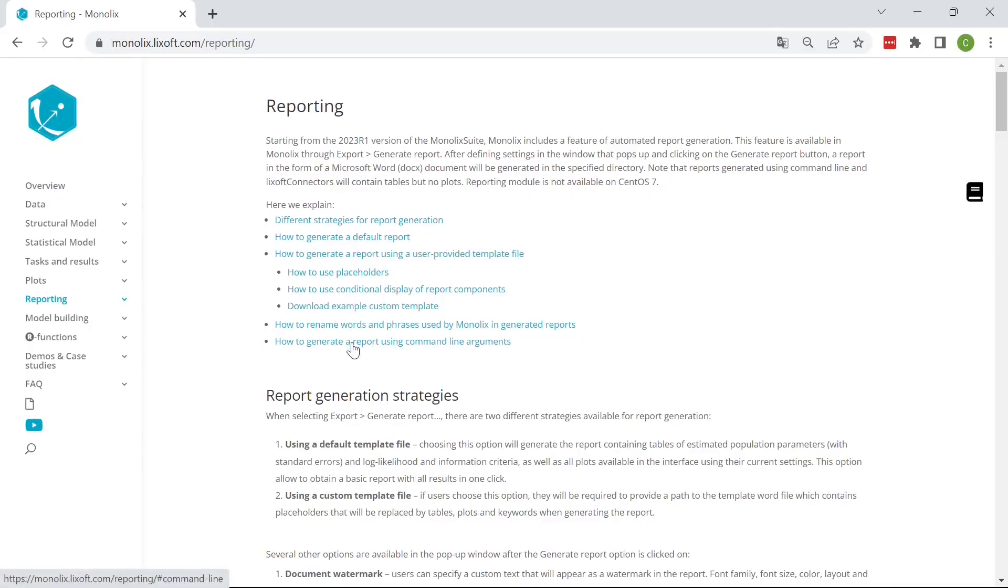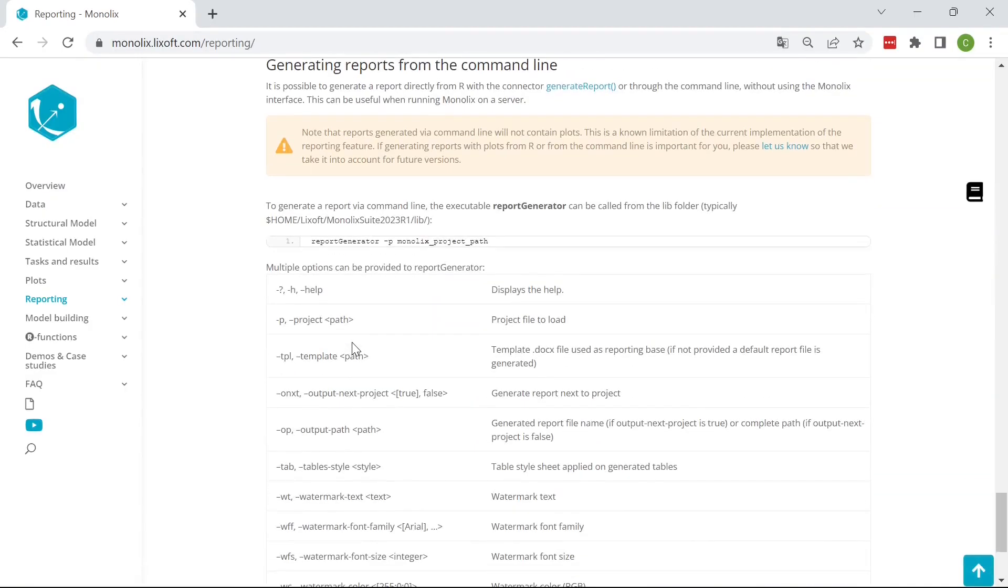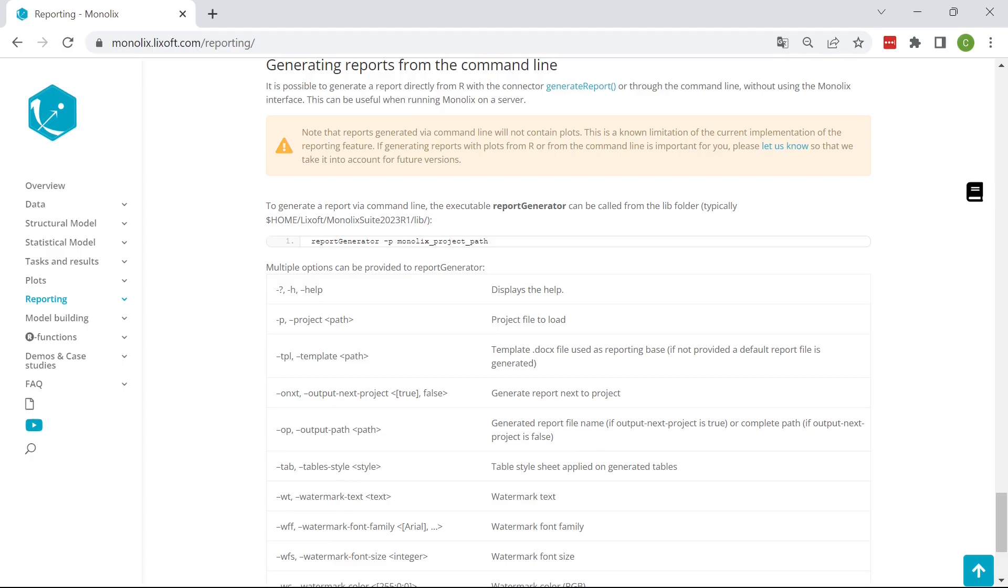It is possible to script the generation of reports either from R with the connector generate report or directly from the command line with the report generator function. This can be useful to generate reports for many projects. However, note that reports generated via connectors or via the command line will not include any plots.